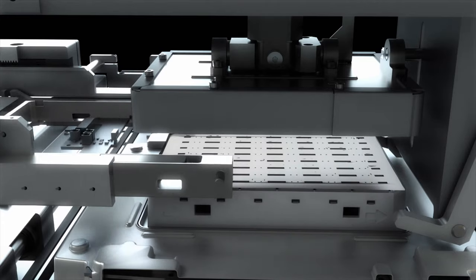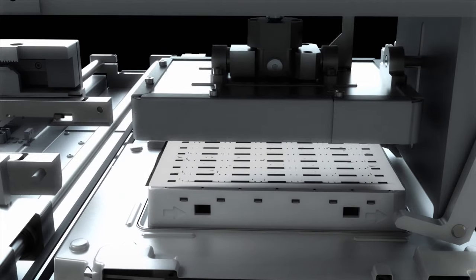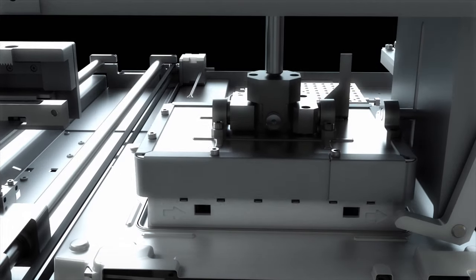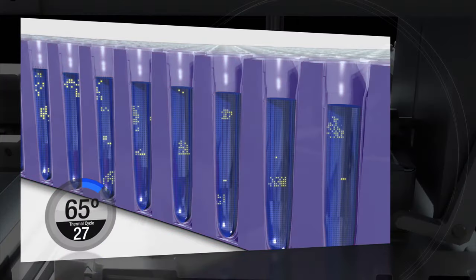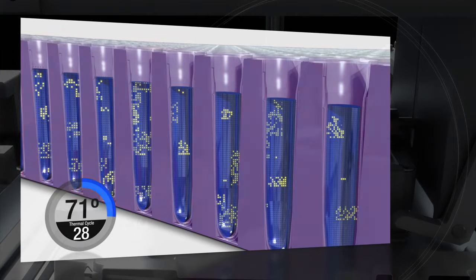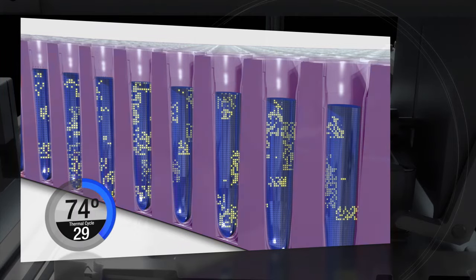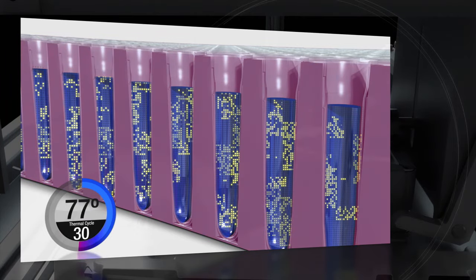The plate then undergoes thermal cycling, in which 20,000 individual PCR reactions occur in each sample well to amplify the DNA.